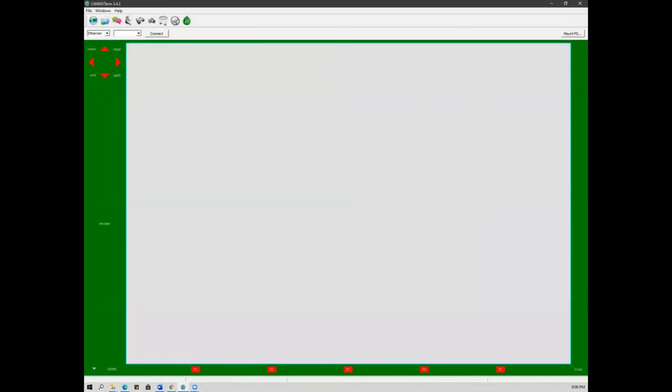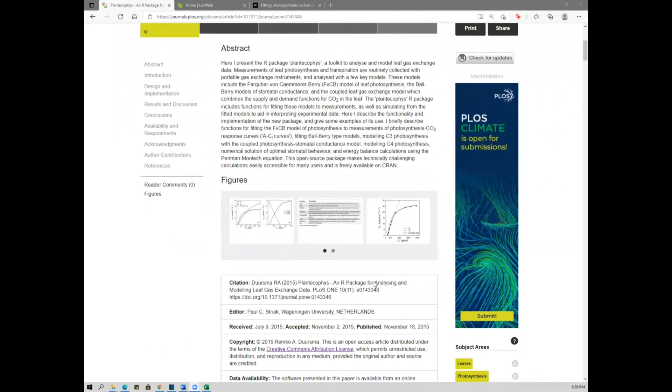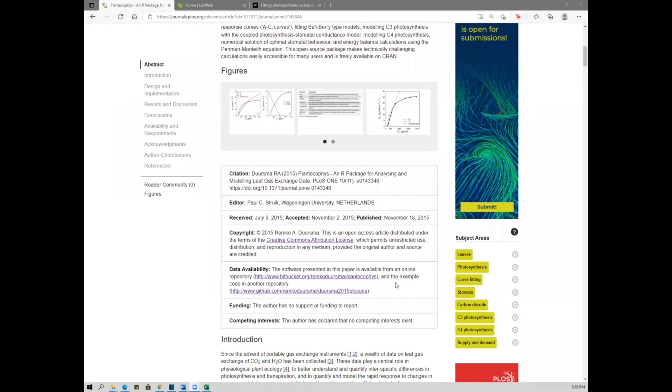There are three ways you can analyze your ACI curve data. The first is using R software. R Studio is an open and free software for analyzing data and developing graphical tools. The website links to a platform where you can download R code and sample analysis data.